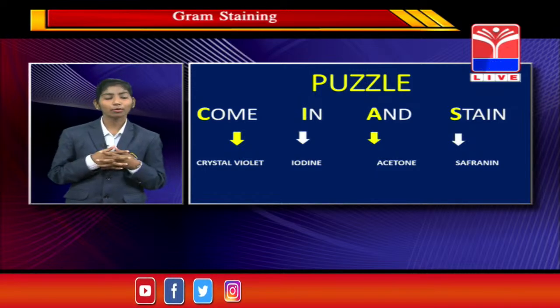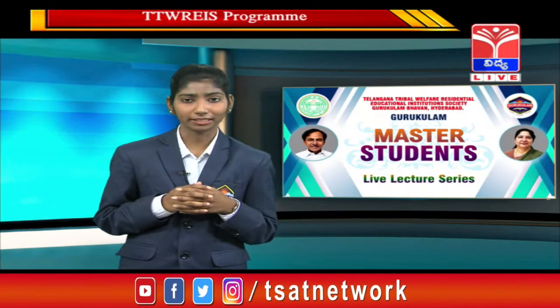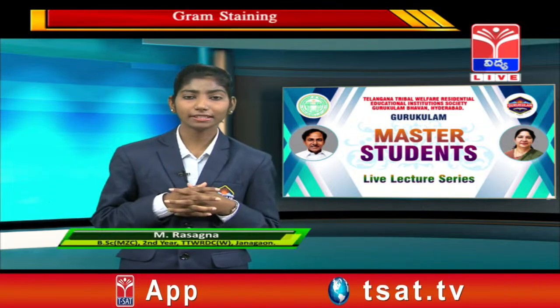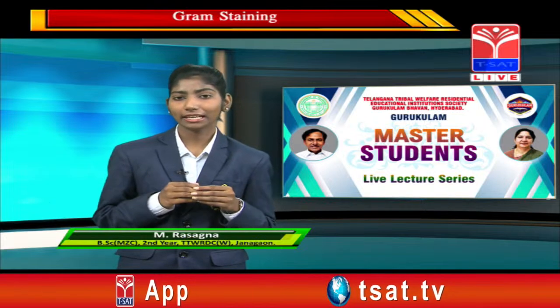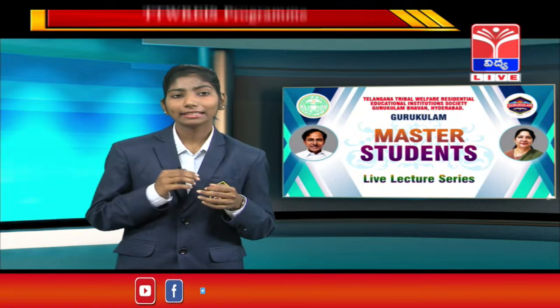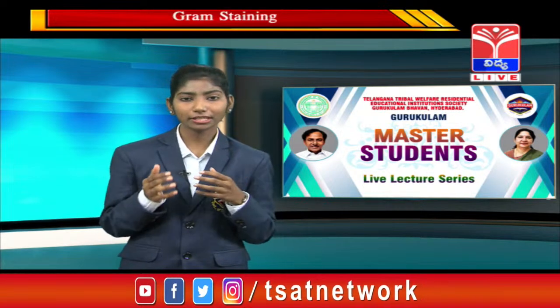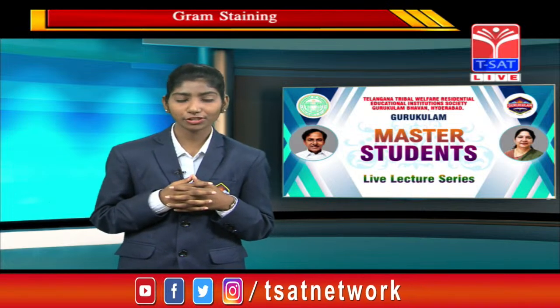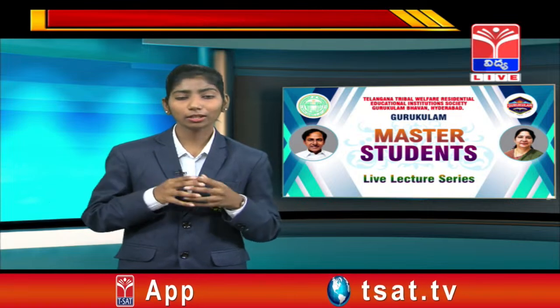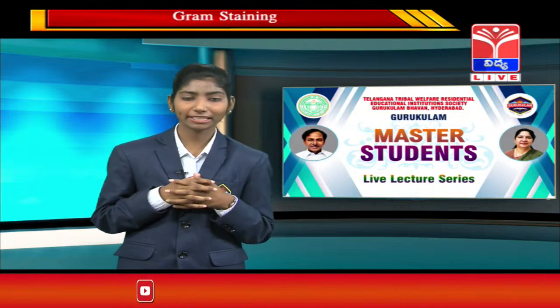So this is about my topic, gram staining. Let me recap what we have learnt. Stains are natural or synthetic substances that can render the structure of cells visible, and gram staining is a method which is useful to differentiate bacterial species into two large groups. They are commonly called gram-positive as well as gram-negative.